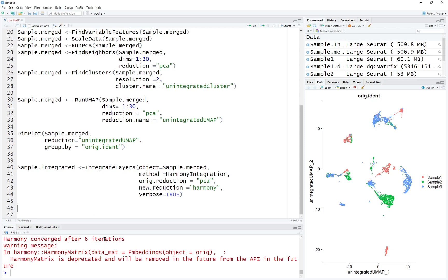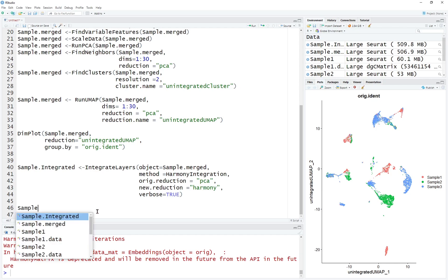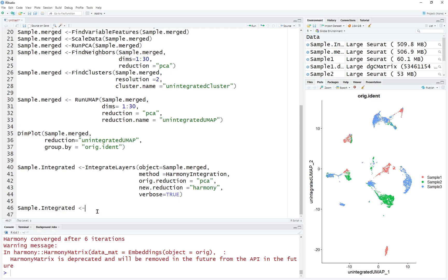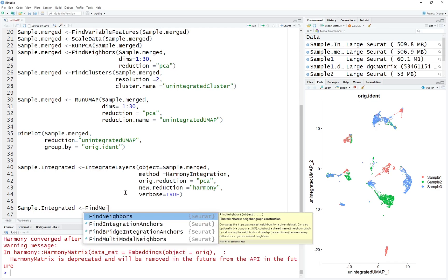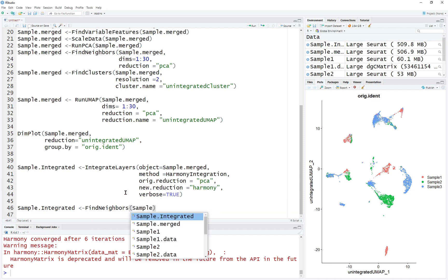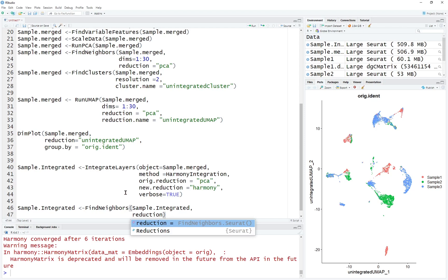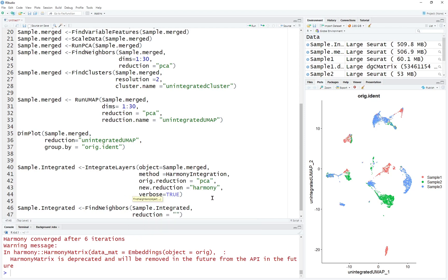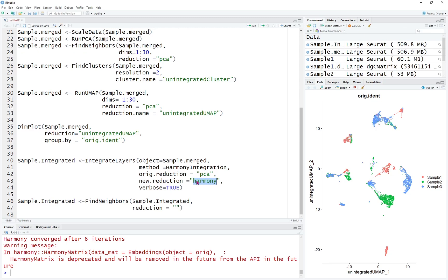The integration has finished. To see how it looks, after the integration we can find neighbors, clusters, and visualize the integrated results again to compare with the unintegrated one. We can call this sample integrated. FindNeighbors — the data will be sample integrated. The reduction here is going to equal harmony — which is what we named it. If you name it something else, keep them consistent.